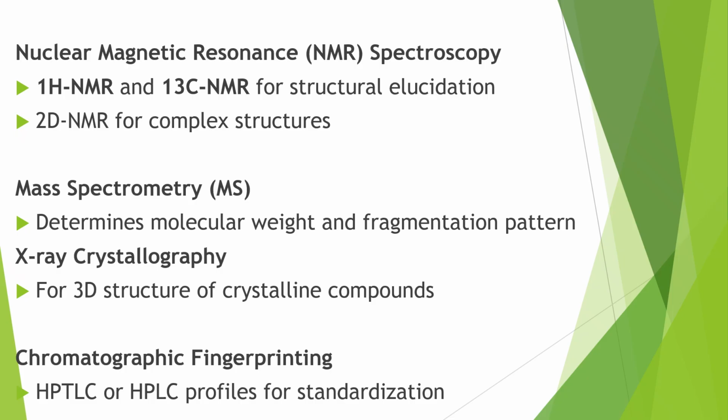In case of X-ray crystallography, it is for 3D structure of crystalline compounds. More specifically, it is a very unique method for crystalline compounds, and such methodologies are helpful in today's era, where there is a big doubt or question, or the purification process becomes stuck along with the crystalline compounds.